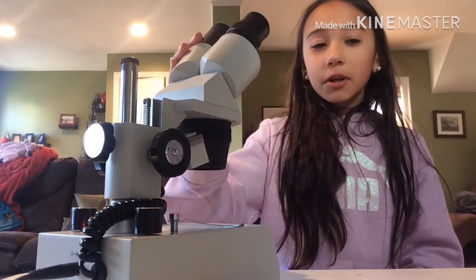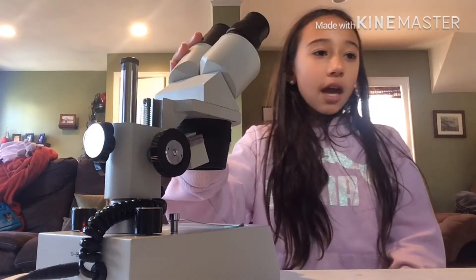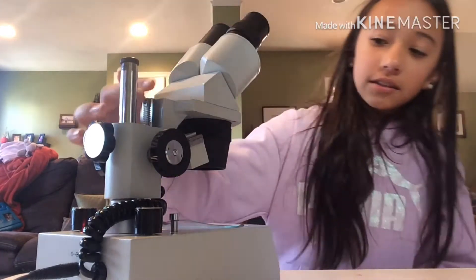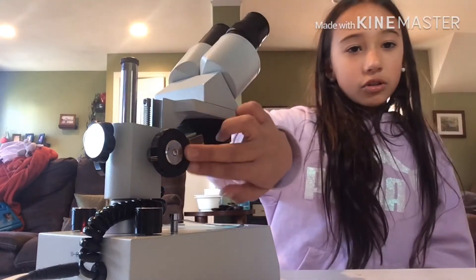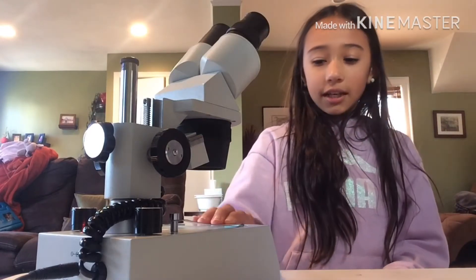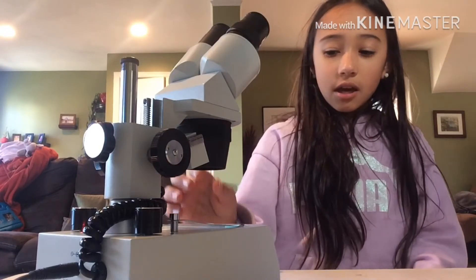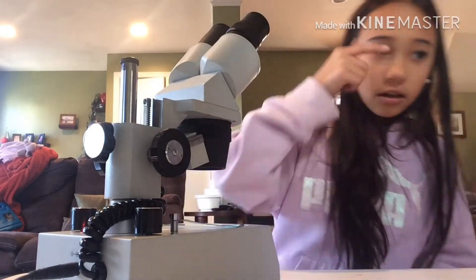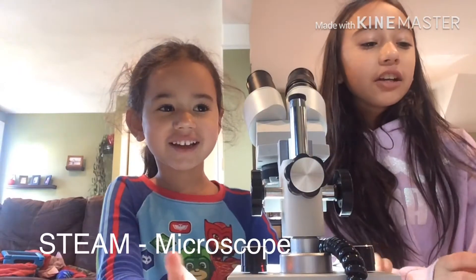Hi guys, today we're going to be working with a microscope. I'm going to introduce you to some of the pieces. These are the eyepieces, this is the arm that's holding the eyepieces, these are the coarse focus knobs that you can use to focus on the object, and here is the stage, the objective lens, and the illuminator down here, and the slides.